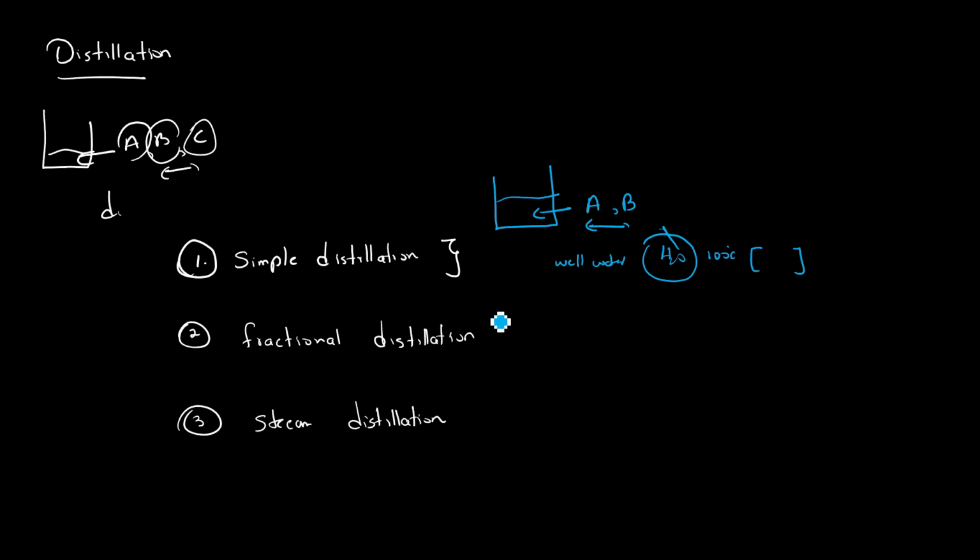in the reagents. Now, with fractional distillation, you can close this particular gap. You can use it for smaller differences, like let's say you have component A which has a boiling point of 50 Celsius and you have B which has a boiling point of 80 Celsius. You can use fractional distillation to separate these things. And the other thing is you can use it to separate several components at one time. The best example is the separation of oil.